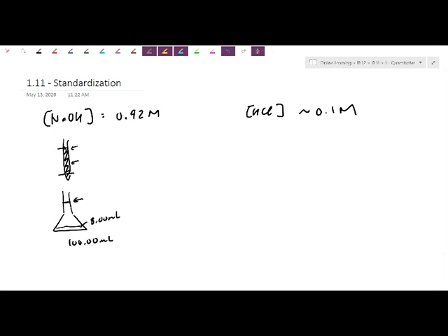So what happens here is we had NaOH swimmers. They used to all be in 8 milliliters, and now I've purposely diluted down 8 into 100. If you remember from our dilution lesson, the moles themselves actually stay constant. The number of particles are actually still there. Dilution just ends up as our formula here, C1V1 equals C2V2. So the concentration is expected to drop.